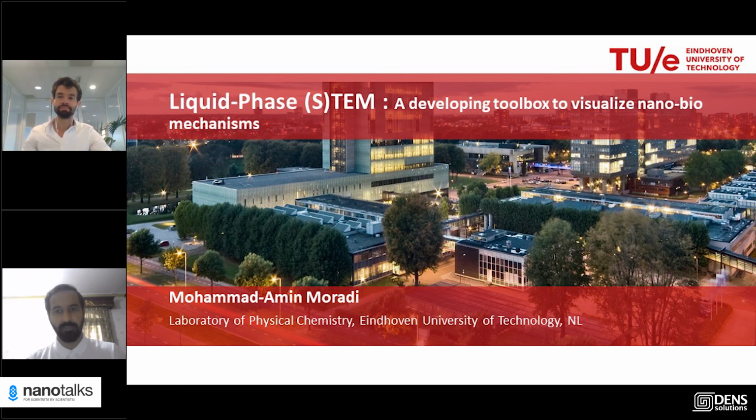Perfectly. Great. Yes. I want to thank Mohammed for the nice presentation. This was just about the difference between silicon nitride and the graphene liquid cell, which I think was very clear in your presentation. I wanted to ask, at the end you showed the graphene nanofluidic cells. Are you thinking about the possibility of liquid mixing in those kinds of cells?